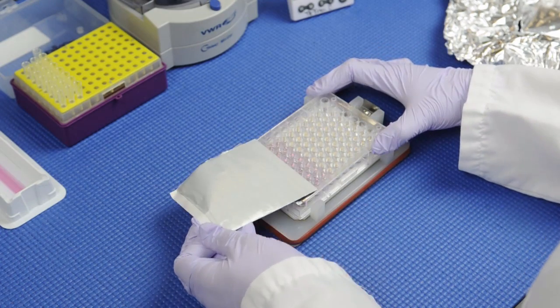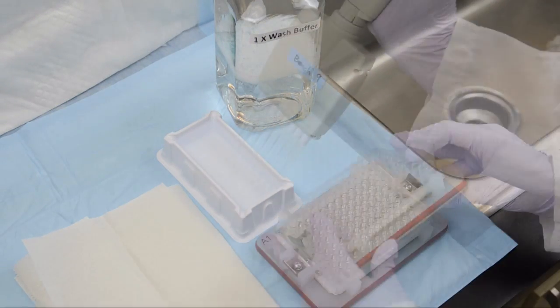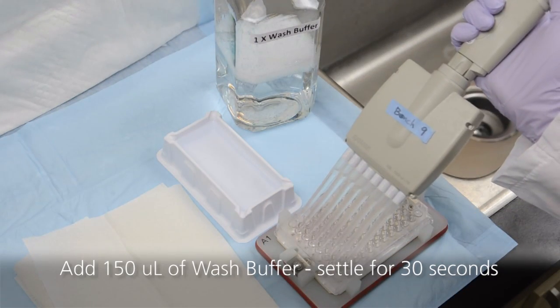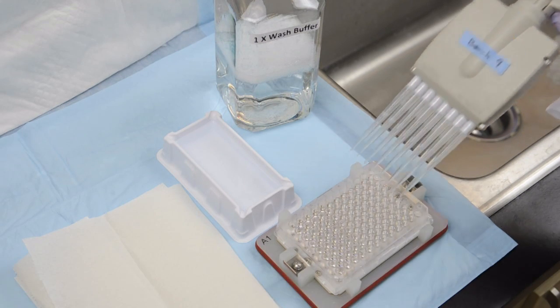Remove the plate seal and quickly invert the plate into the sink to remove the solution in the wells. Pipet 150 microliters of wash buffer into each well and allow the beads to settle to the bottom of the plate for 30 seconds.